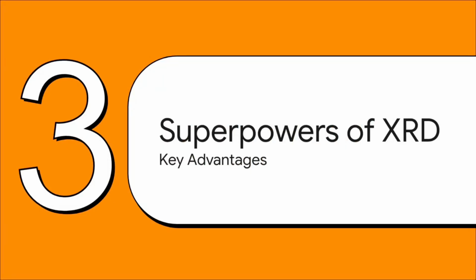Which brings us to Section 3, the superpowers of XRD. One truly incredible metric here is this number, 20 minutes. I mean, think about that. That is incredibly fast for atomic-level analysis. One of the biggest advantages of XRD is just its raw speed. Sure, some super complex analyses might take a bit longer, but routine measurements, they can usually be totally wrapped up in under 20 minutes. This lightning-fast turnaround is absolutely crucial for things like quality control in manufacturing or in high-volume research labs where you might need to blast through dozens of samples in a single afternoon.